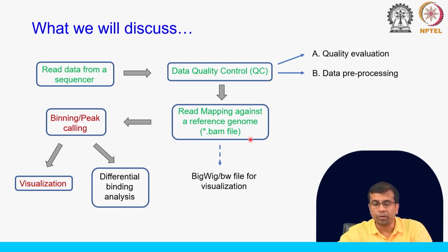The other part that we will also do is we will take a BW file, a bigWig file, that is often deposited and generated from a BAM file, because these are much more compressed files, and we will visualize the data. For many cases we will see these BW files associated with data sets that are submitted, and we want to see the pattern of the mapping of the reads, etc. Okay. So, this is what we are going to do using two different data sets.